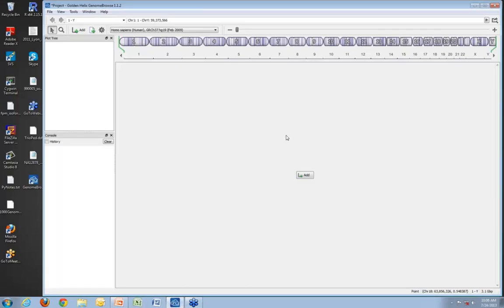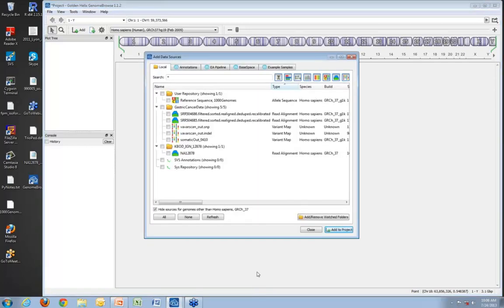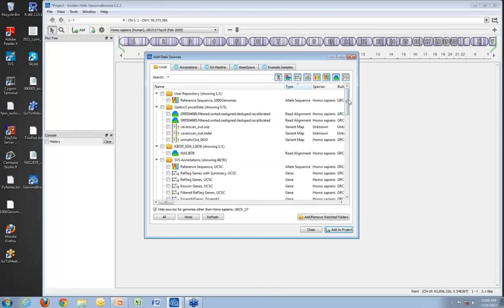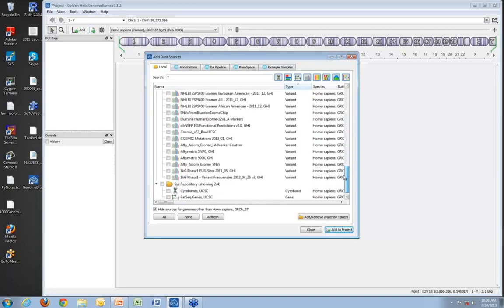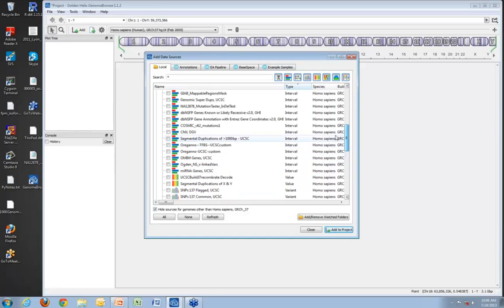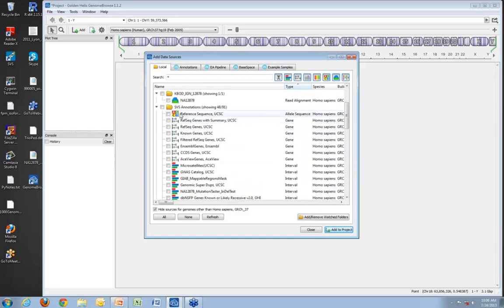When you first open Genome Browse as a new user, you'll see an empty screen with an Add button. Clicking it, if you happen to be an SVS user, you'll have a library of annotations downloaded for use in SVS. All of your SVS annotations are also viewable within Genome Browse — the complete list of everything currently available on my computer from my SVS annotation library is immediately visible.